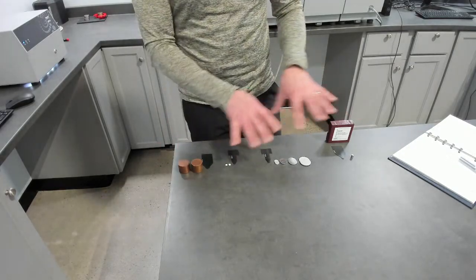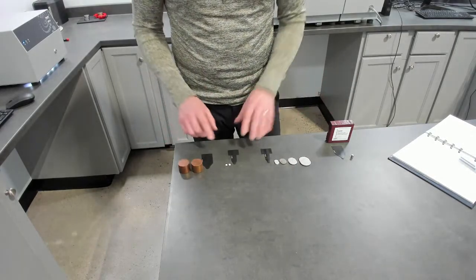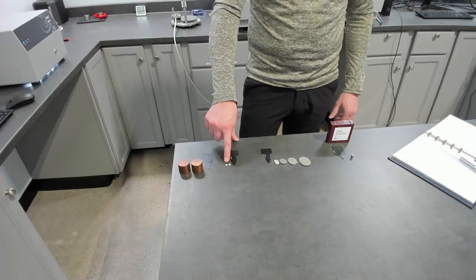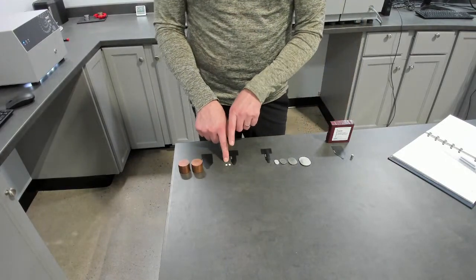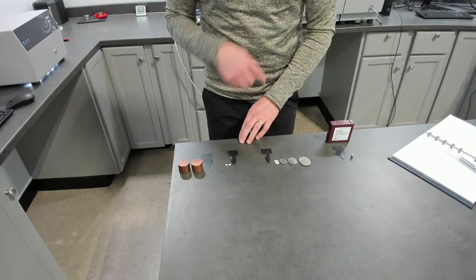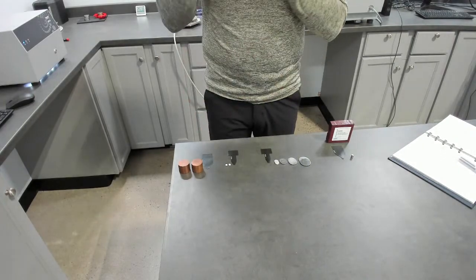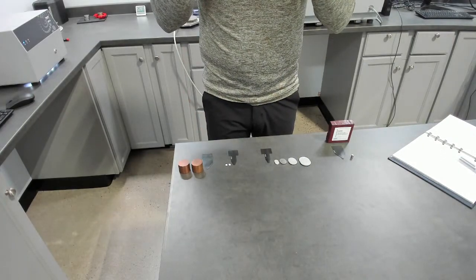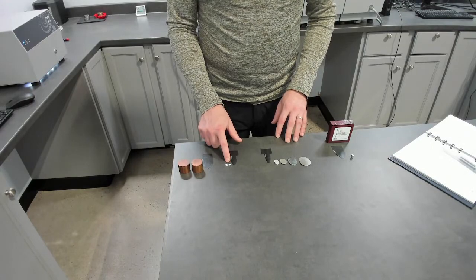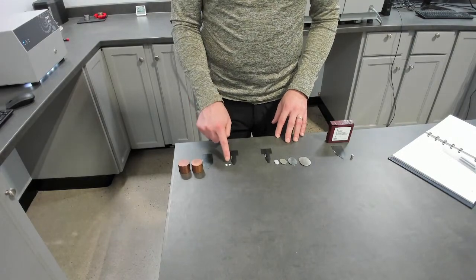So we have demonstration videos on all these individually, so I invite you to look at them, but collectively what I wanted to describe was the importance of short test time. So on Macor, based off the diffusivity, the test times that one could use on the MP-1 are 0.25 seconds to 0.5 seconds. So again, another example of the importance of variable test time, even when you don't have high conductivity or high diffusivity, even just due to the physical size.